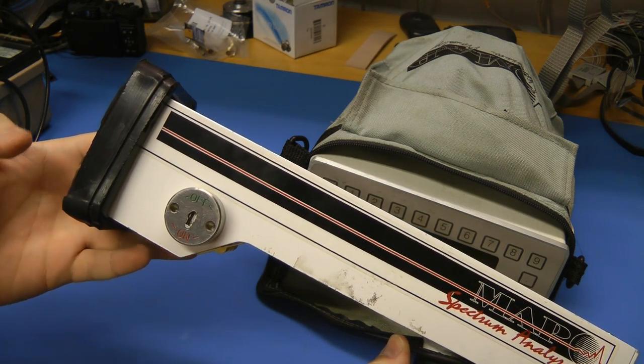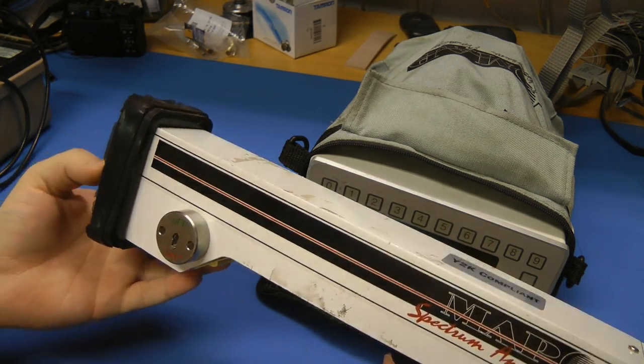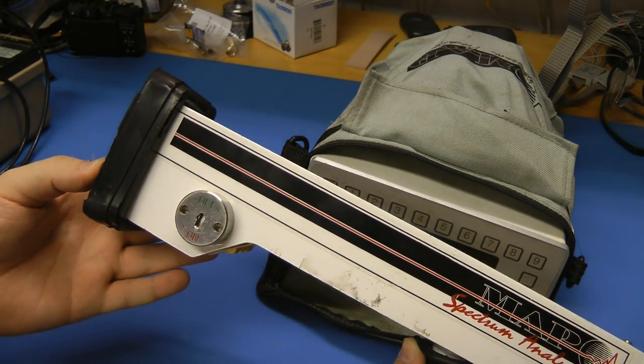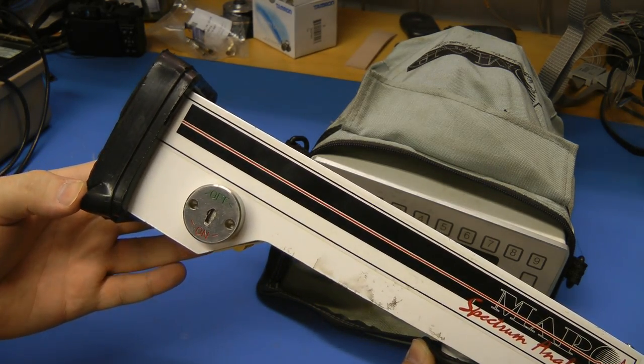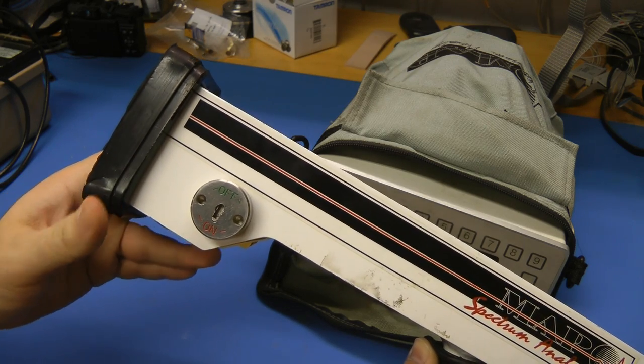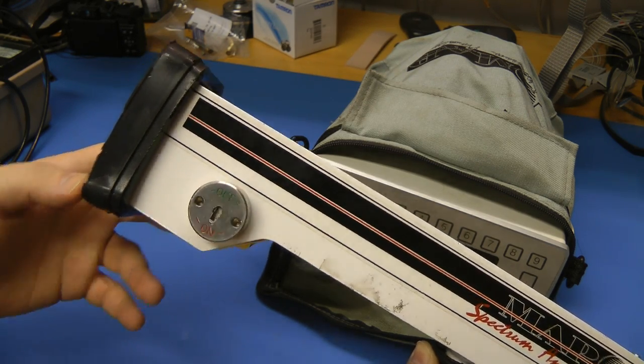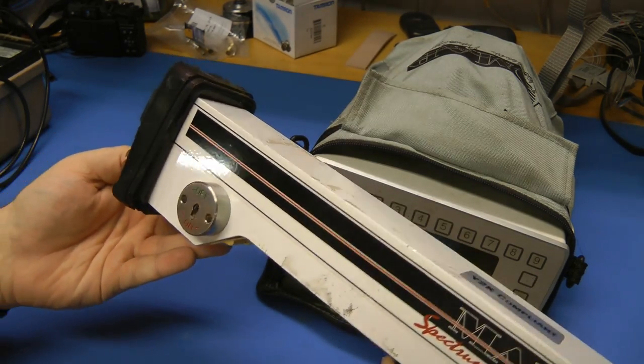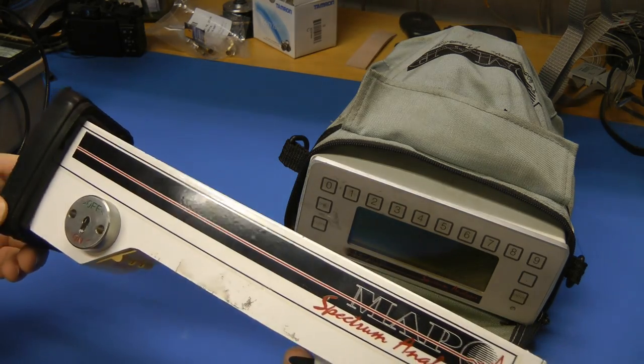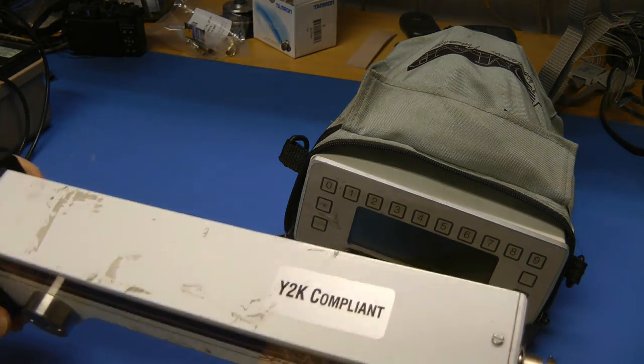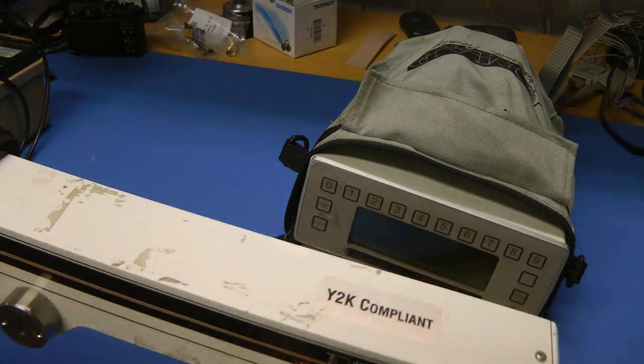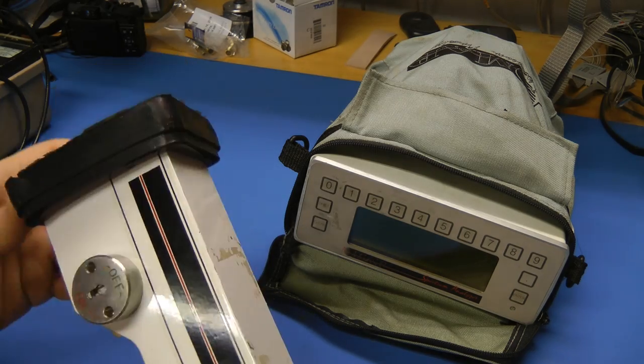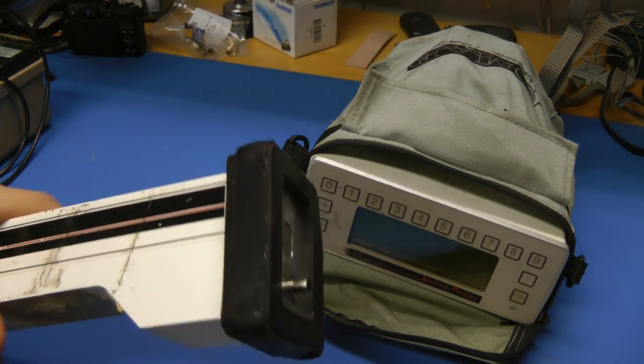And the cobalt-57 apparently was the most common. And that does 122 kiloelectron volt gamma rays. The americium, I think, was 60 or so, and the cadmium is about 200. So there's some different sort of spectrum options for the source. The half-lives of those isotopes vary from about 270 days for the cobalt and about 400 days for the other ones.